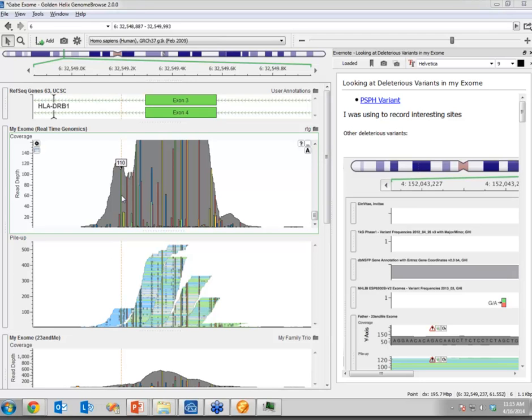There are other algorithms to look at, and I wouldn't say you should stop there. It's certainly on the burden of someone developing a clinical pipeline to do an empirical analysis on the type of data, on the type of sequencing platform and chemistry they're using to validate that they're getting accurate sensitivity and specificity on that.